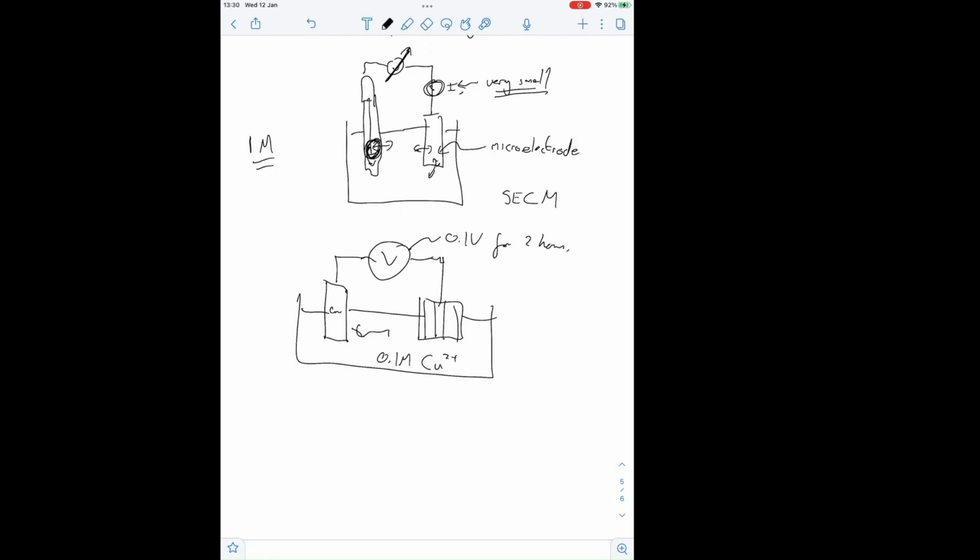I'm going to do that experiment. That's what's reported in the literature, so I'm going to do that experiment. It's impossible to reproduce that experiment exactly. If you want to begin to reproduce that, you need the area of this electrode, the area of this electrode, because then we might know how, when I change the potential, it's partitioned across those. I also need to know the distance between the electrodes, because there'll be some IR drop there.